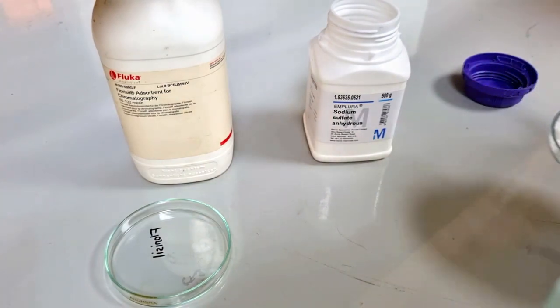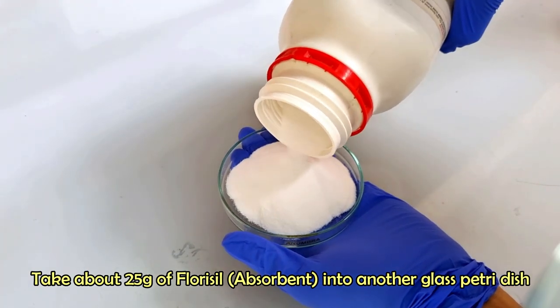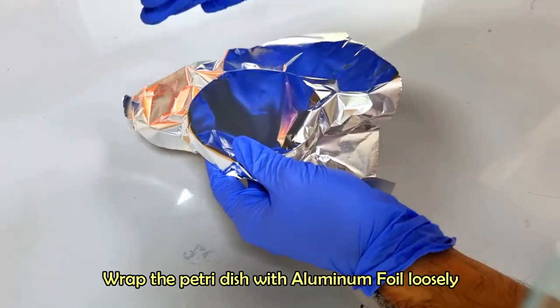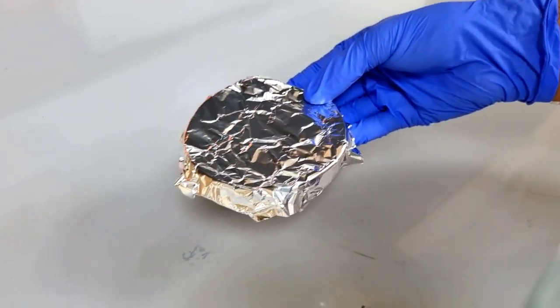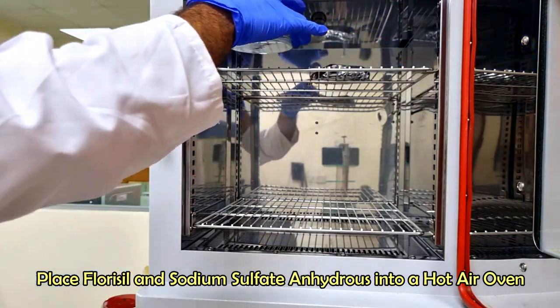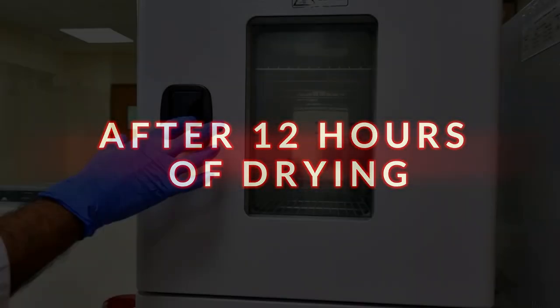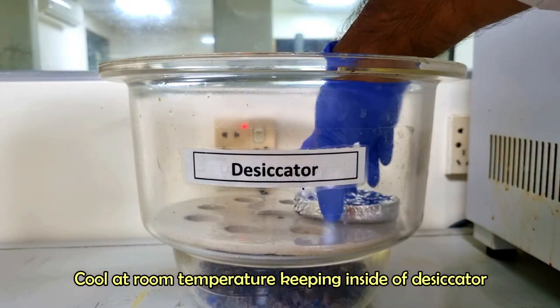Take about 25 grams of Florisil in a glass dish, loosely covered with aluminium foil. Use activated Florisil PR grade. Heat the Florisil and sodium sulfate in an oven at 130 degrees Celsius overnight to remove the moisture content. Cool the Florisil and sodium sulfate in a desiccator before use.